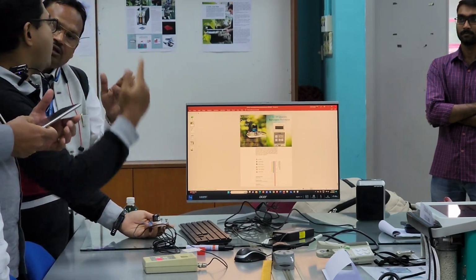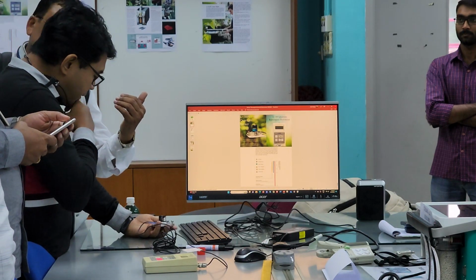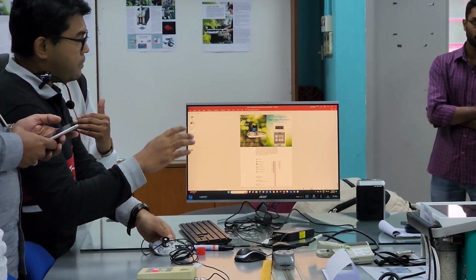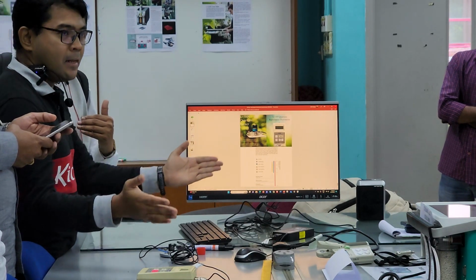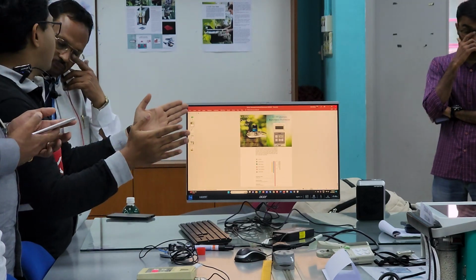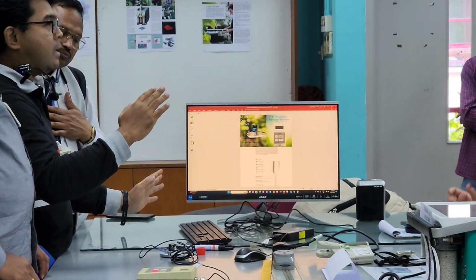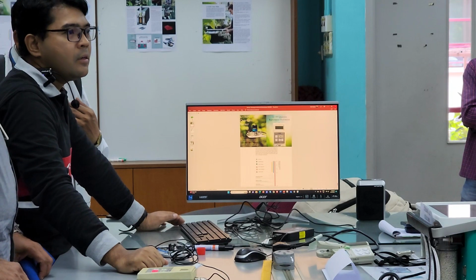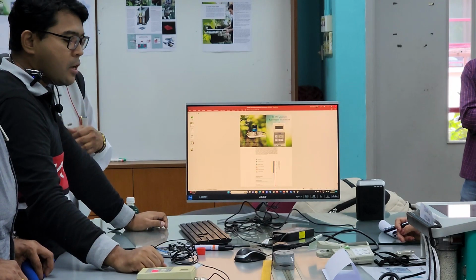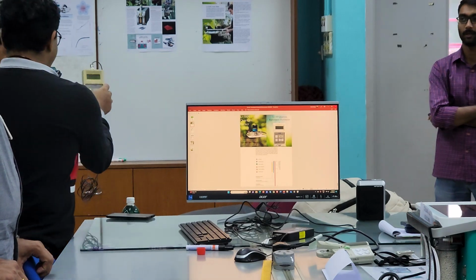Both sunlight and also artificial light. Artificial light is measured by whether it is sufficient or not for photosynthesis. So, for example, if you are dealing with salad plants, you only need around 400 micromole of light. That's the maximum of it. You don't have to give 1500 or 2000 micromole. That is for rice, for grain crops. So I can show you here.